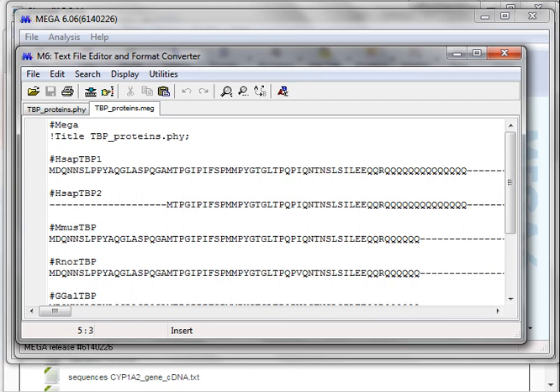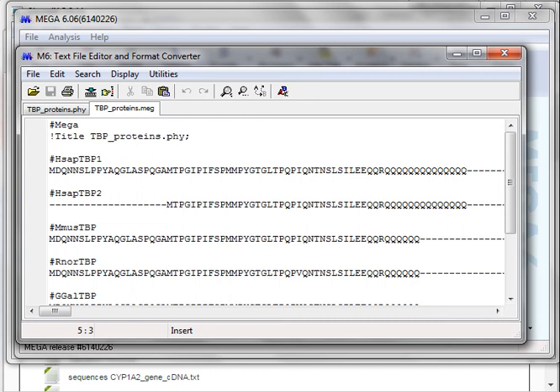And you may test phylogeny using different statistics and phylogeny tests. The most commonly used is bootstrap. And you should select not more than 1000. But you can give 500 as a number of bootstrap. It will construct 500 trees and ensure each node, each branch of the tree to validate, statistically validate your tree. And then you compute and wait. Most of the times your tree is pretty quick to get.